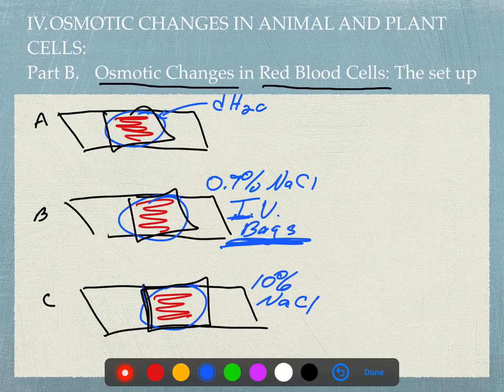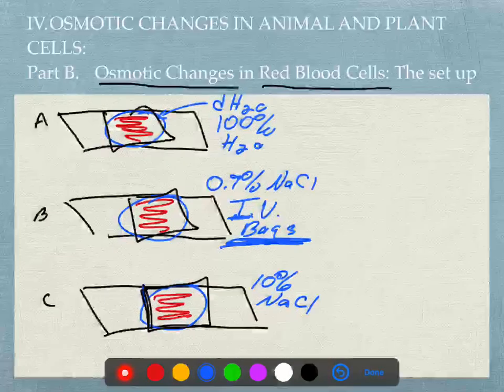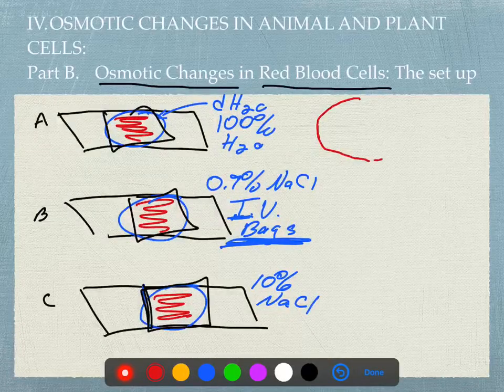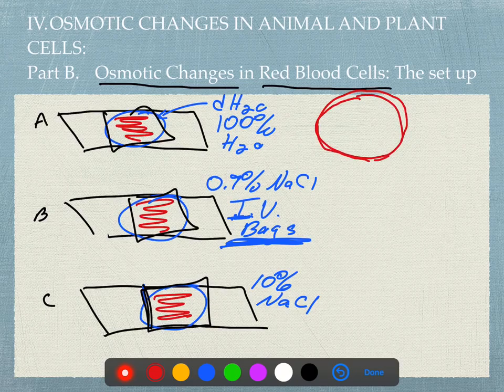So what do cells look like when you place them in 100% water, such as deionized water? Well, those are going to feel and look bloated.